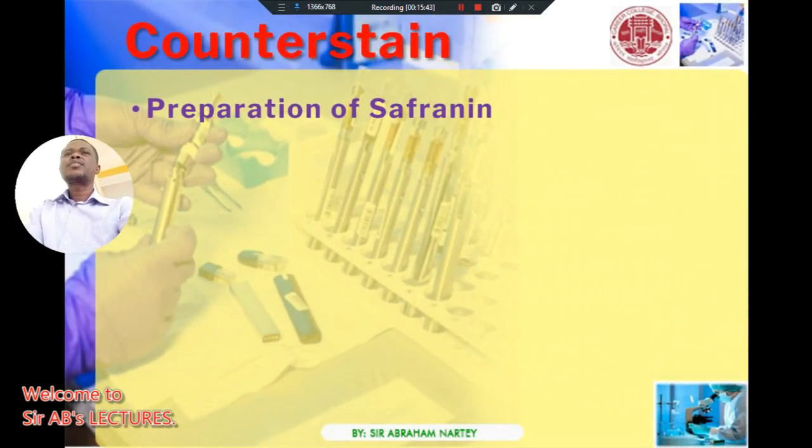So that is how you prepare the decolorizer. Then next one, we come to our counter stain. The counter stain, we are using safranin over here. I have taught you already that with the counter stain, we can either use safranin or carbol fuchsin. But in this lecture, we want to consider how to prepare only the safranin.